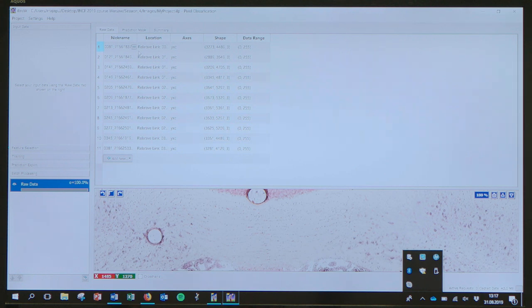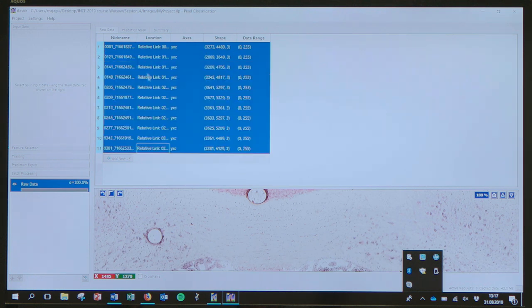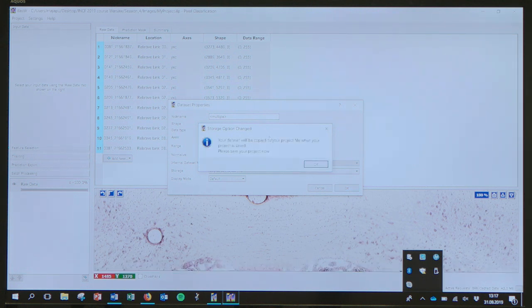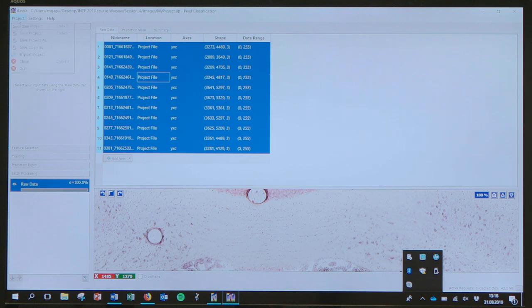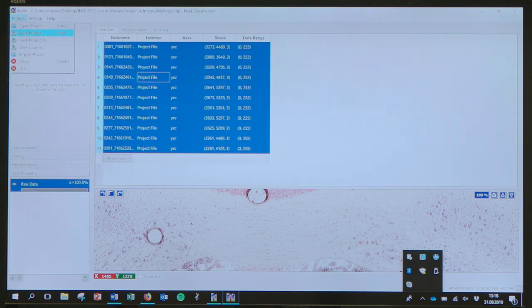To make the file more stable, a tip is to save all the images to the project file. To do that, highlight all the images and click on 'Edit Shared Properties', then change the storage to 'Copy to Project File' and press OK. Then it asks you to save the file — go to Project and then Save Project.